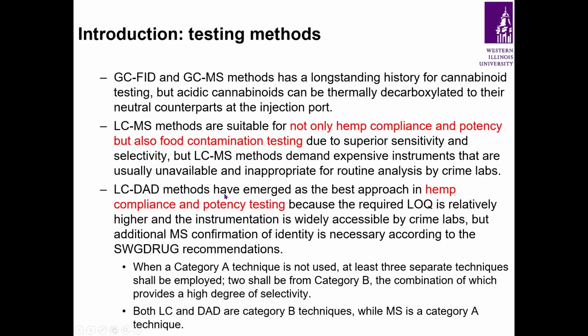LC-DAD methods have emerged as the best approach in hemp compliance and potency testing because the required LOQ is relatively higher and the instrumentation is widely accessible by crime labs. However, additional MS confirmation of identity is necessary according to the SWGDRUG recommendations as follows.